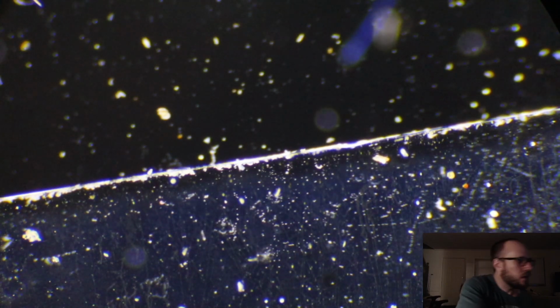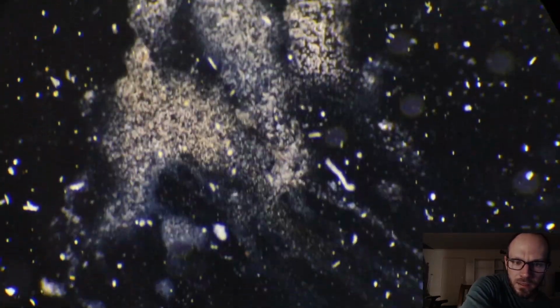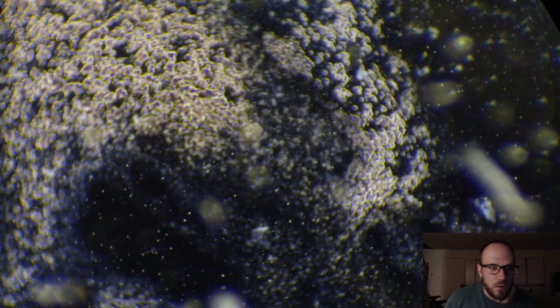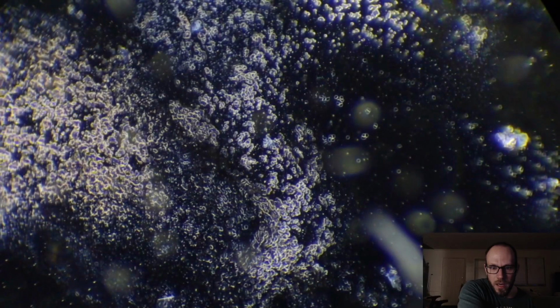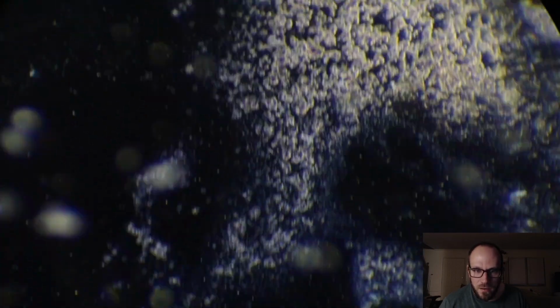Cool. Gotta actually visually look at where it is, it's so faint. Is that it? I think that's it. It's so small. Yeah, I think that's it. What we are looking at is me. I don't think there were many blood cells in this. I think it was like other stuff, but I did actually nick myself on my door, and this is what came out of me.